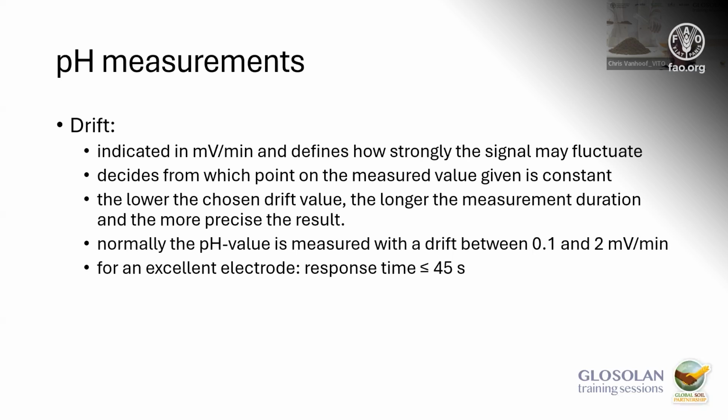It's also important to have a proper response time that is not too long. If the response time is too long, it's also an indication that your electrode degrades and that you have to make some changes.